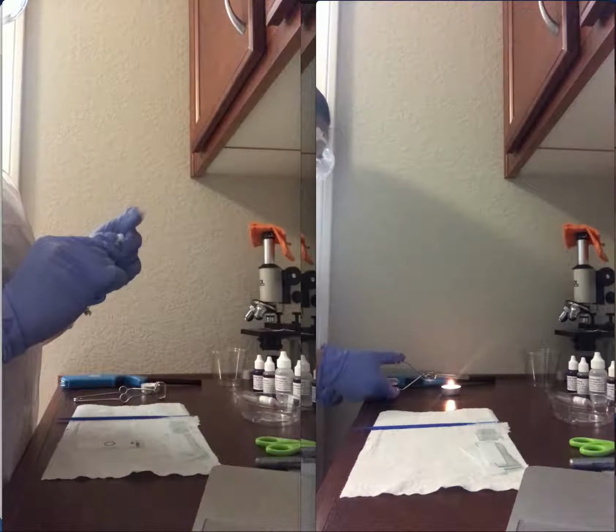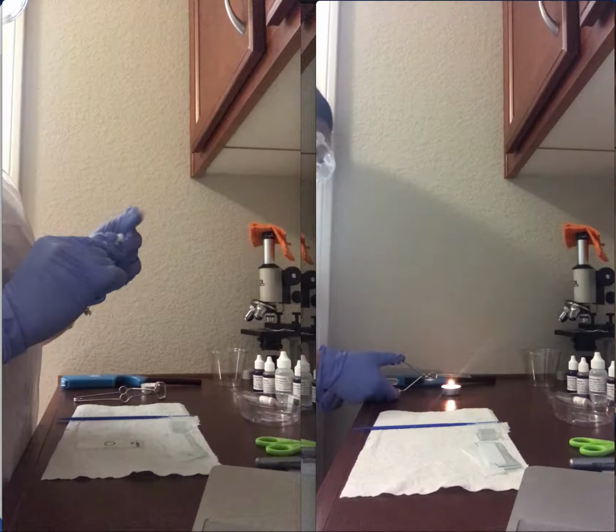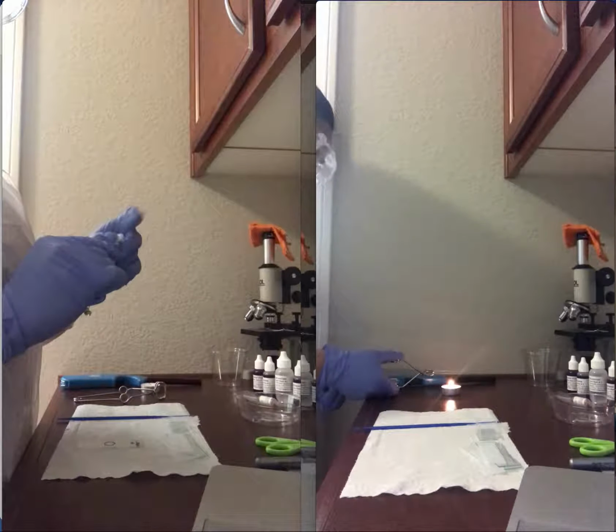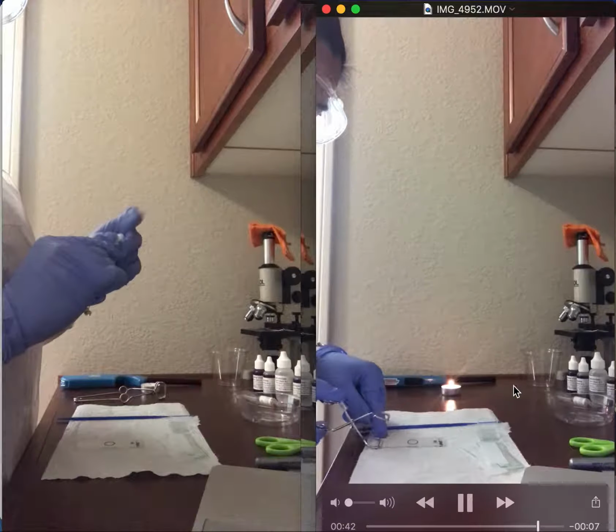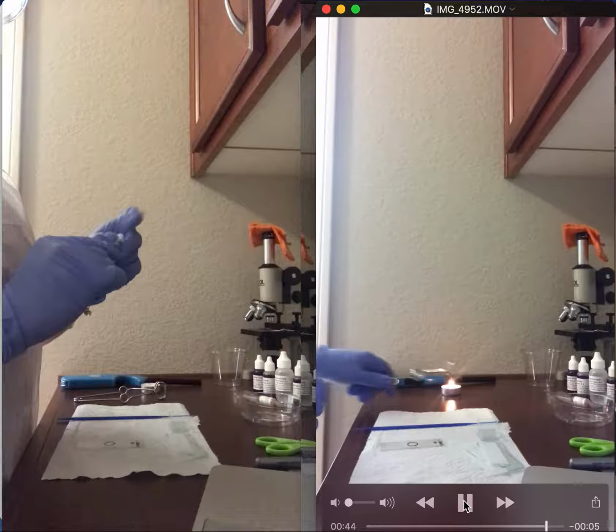We are going to pass the slide over the flame 5 times. And then allow this to cool off for at least 10 minutes.